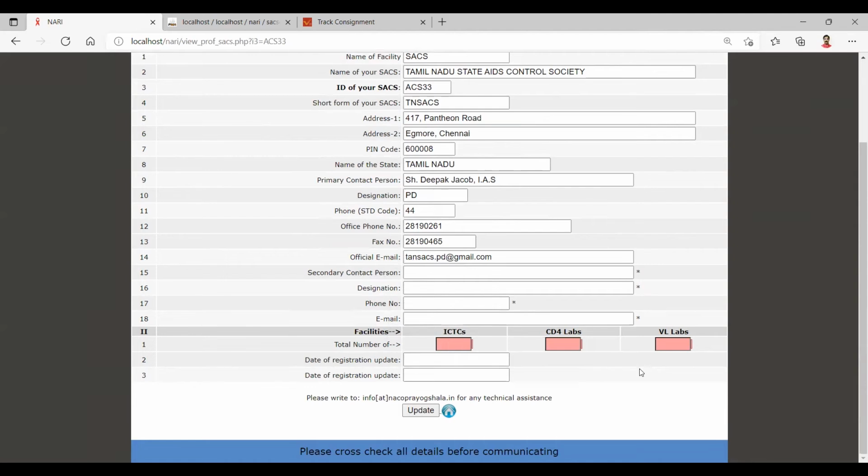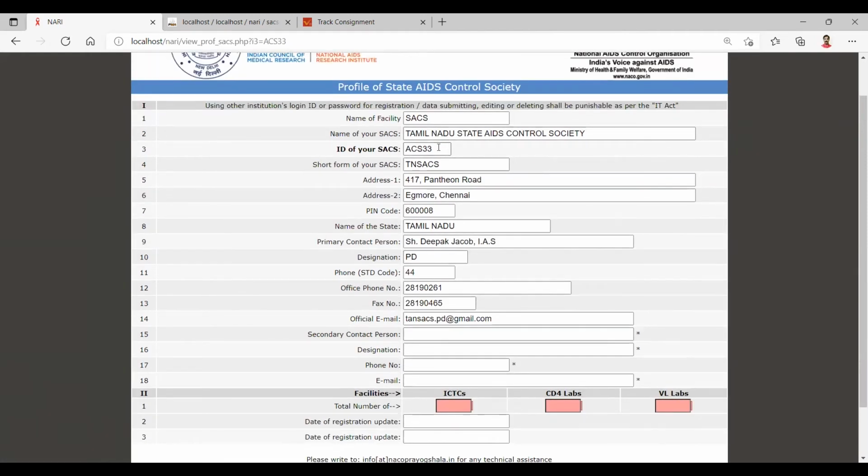Once you are typing, you will not be able to leave from there. You have to submit it and update your data. Otherwise, the red signal will be there. So you can go through each and every line. It's only one line. It's not able to change it.